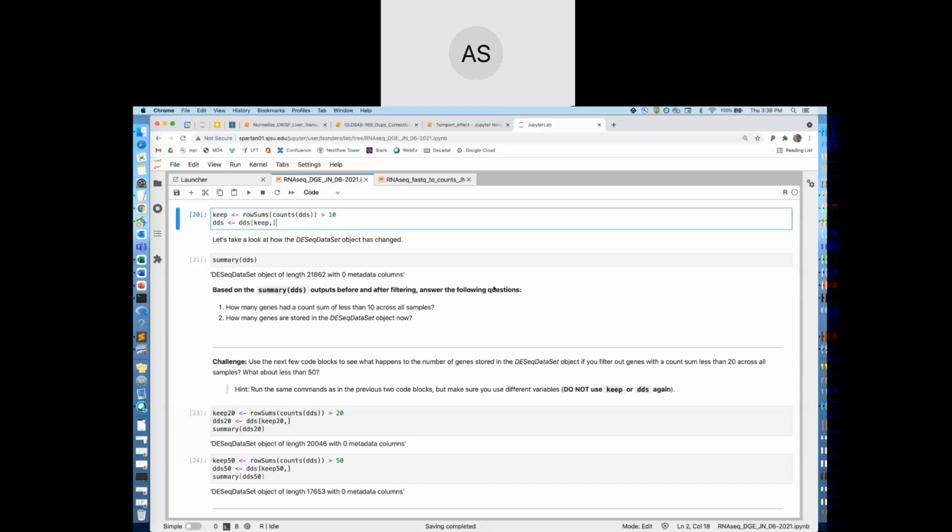Yeah, that threw me for a loop a little bit when I first started using DESeq2. I know other groups, instead of filtering on just a value, will filter out the lowest expressed 10% of genes or 20% of genes.